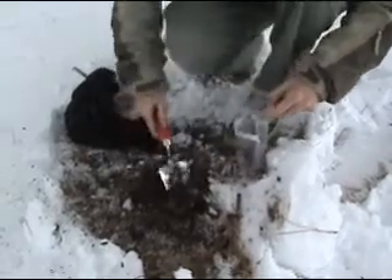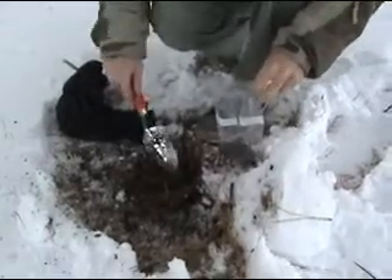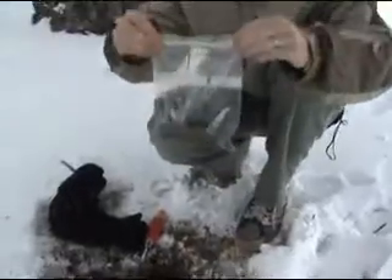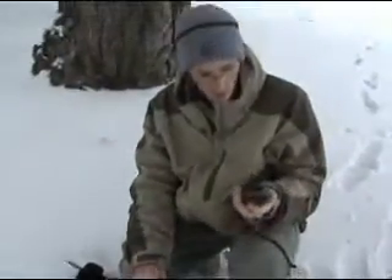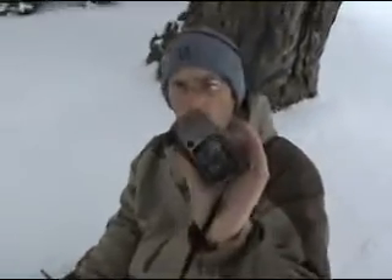You don't need to fill the bag up — just a couple of scoops. You don't want to go too deep either, because most of these microorganisms are going to live on the top layer. Then you just want to take your GPS and write down the coordinates of where you're at.